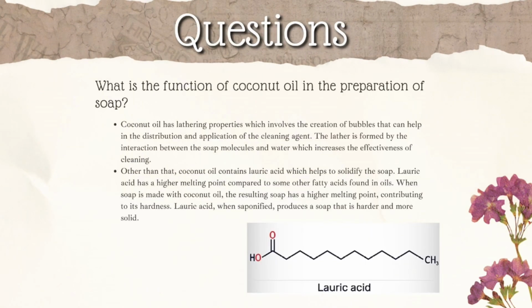The coconut oil has lathering properties, which involves the creation of bubbles that can help in the distribution and application of the cleaning agent. The lather is formed by the interaction between the soap molecules and water, which increases the effectiveness of cleaning.